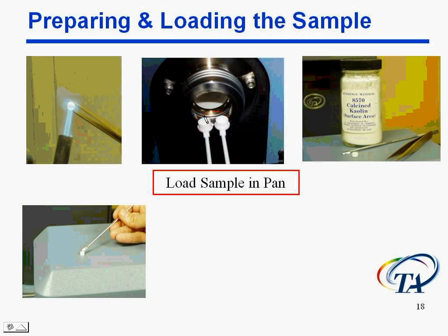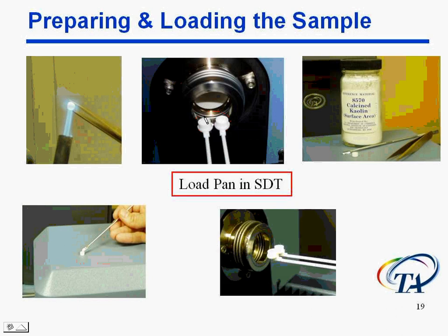And then lastly, you would load the pan onto the beams, close the furnace, and then you could start your program.